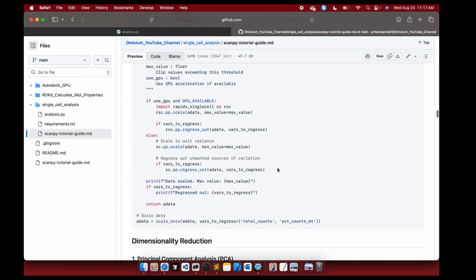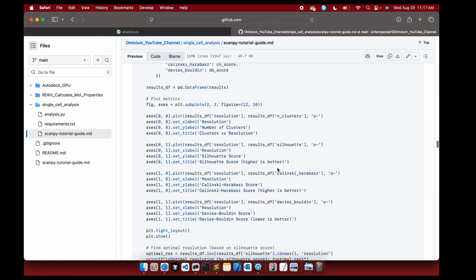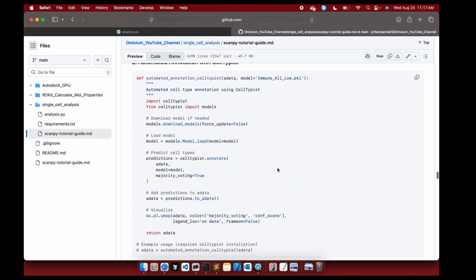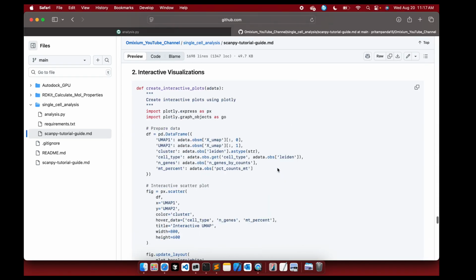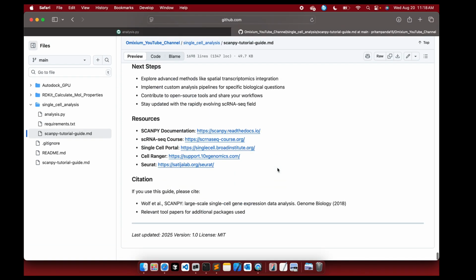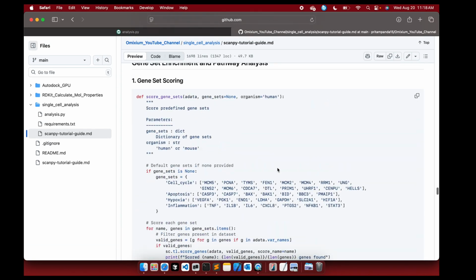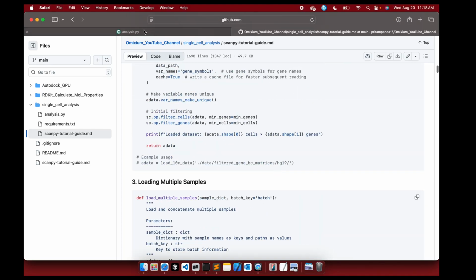If you want to analyze in a deeper sense, if you want to analyze even more, then you can find all the codes and analysis that you can run via the Scanpy package. And remember to use the latest Python packages so that you can run it faster and in a very nice manner. So yeah, that's it, and thank you very much.